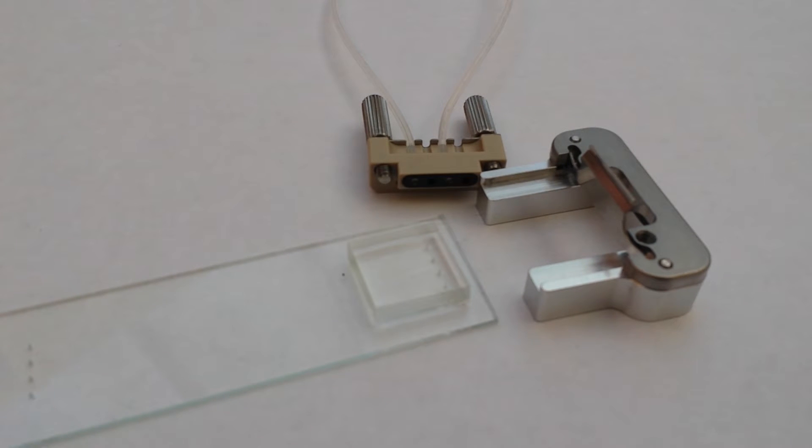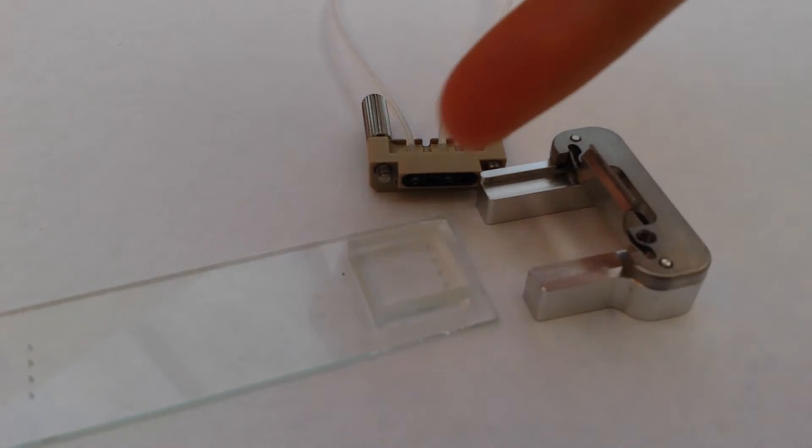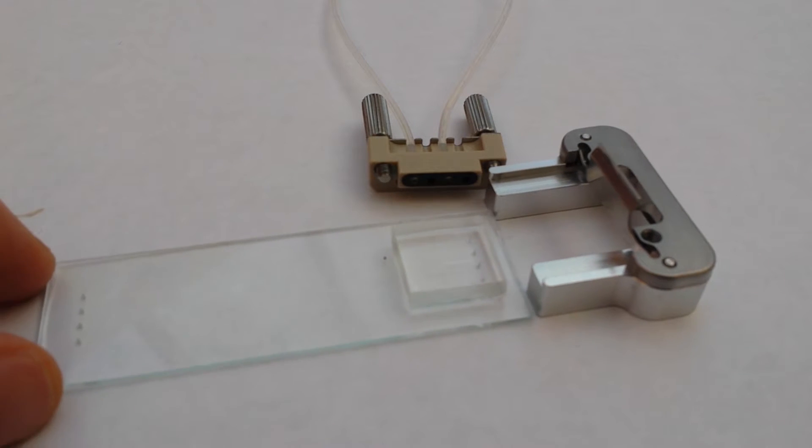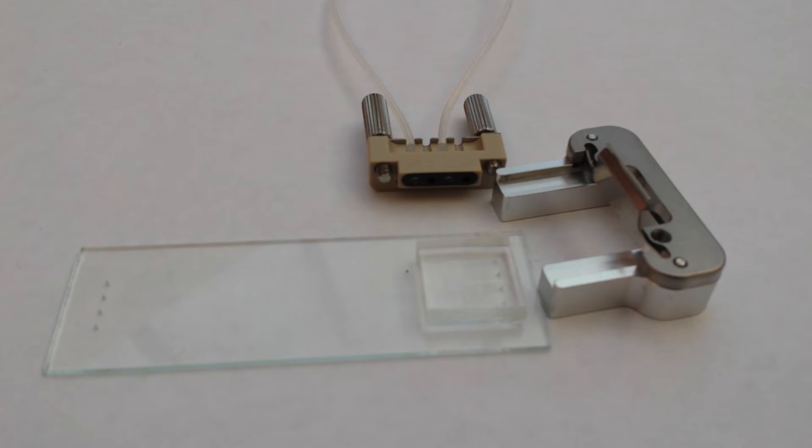This is a quick video regarding the PDMS interface system from Dolomite. It's an interface system for people making their microfluidic devices out of PDMS. What we have here is a PDMS constructed device mounted on a glass slide. Dolomite provides these glass slides, and there are some very good design rules for Dolomite's glass slides and interfaces in general.